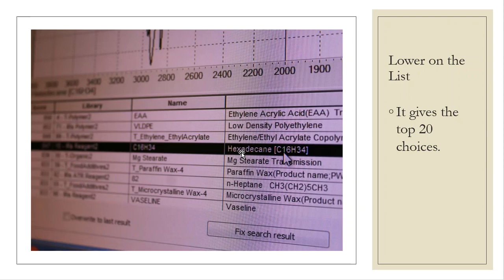I mean, they're both straight chains, they're both carbon-based, they're both hydrogen-based, they're both hydrocarbons, they have no functional groups on them. They are structurally very, very similar, except one just has fewer carbons than the other one, right? And it's measuring the fingerprint of these compounds as they're coming through, and those fingerprints are very, very close. So hexadecane does show up. It's there. So I feel really good that this is the alkane that my urea has captured at this point.